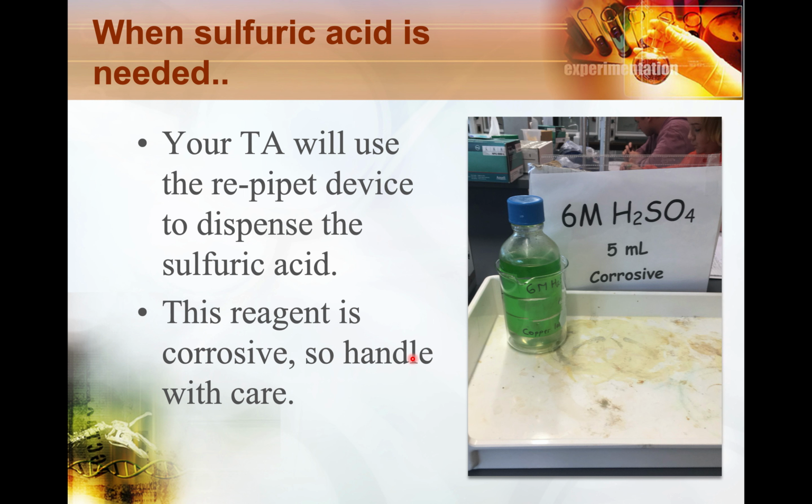In another step, you'll be using sulfuric acid. This again is a very dangerous corrosive material, so we'll have the TA use it first. Be cautious, be careful, and we're going to handle this with extreme care as well.